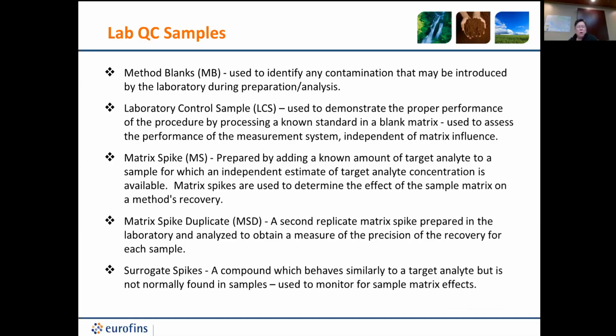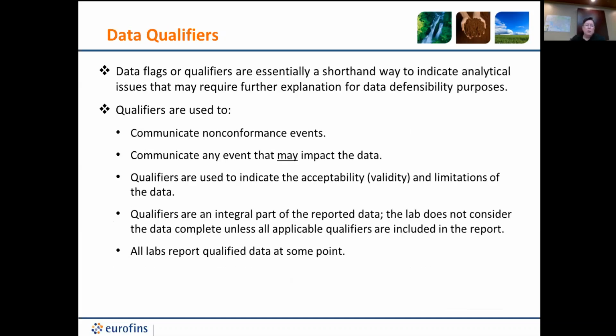So mostly what you might see in your reports is a method blank, a lab control sample, and possibly a lab control sample duplicate for the tests that are being reported. And that would be fine. That's showing that you have precision and accuracy and you're not receiving any kind of contaminated results from the laboratory. But sometimes you're going to see, yes, go ahead.